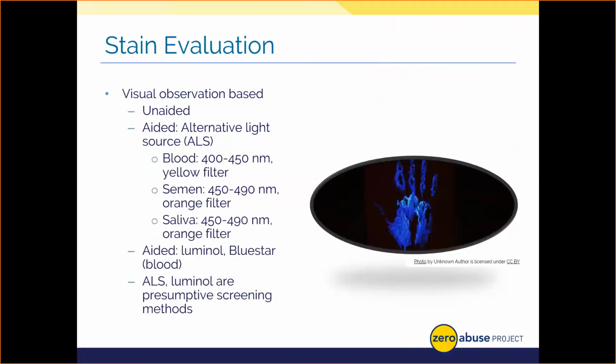Before we can determine what serological tests we need, we have to actually observe a potential stain on an item of evidence. At times, we can see stains with the unaided eye, but sometimes dilute stains or stains that are on non-contrasting backgrounds are pretty hard to see. So we use different wavelengths of light, measured in nanometers, via alternative light source, or ALS devices. We scan the entire garment, the inside, the outside, front and back, in and out of each sleeve and pant leg, and so on. It is quite a time-consuming process, I'll be honest.